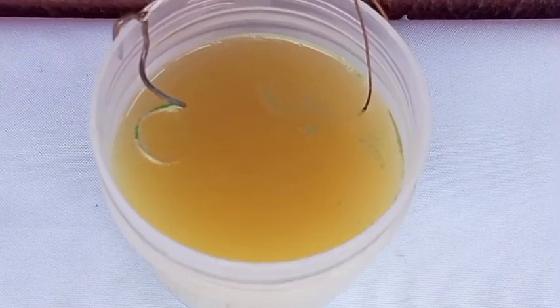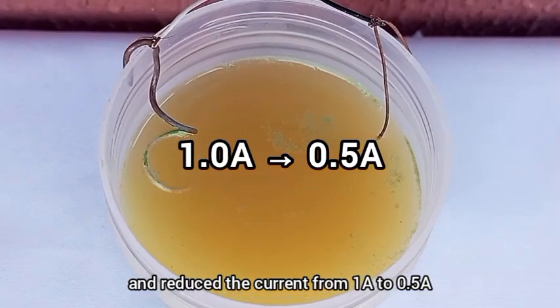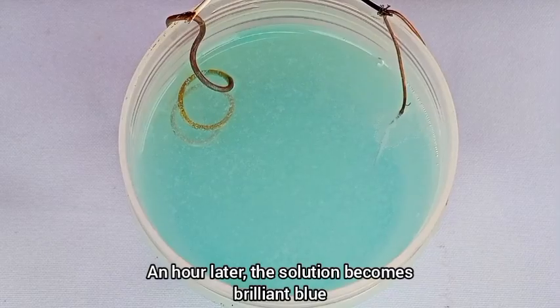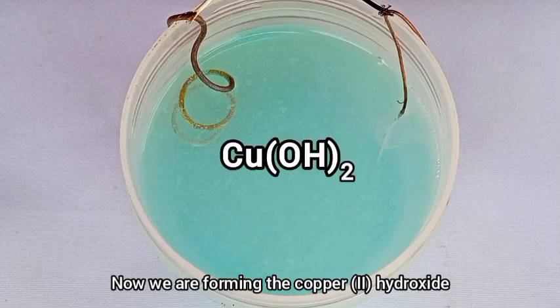So I removed the solution, added a fresh batch, and reduced the current from 1 amp to 0.5 amps. An hour later, the solution becomes brilliant blue. Now, we are forming the copper(II) hydroxide.